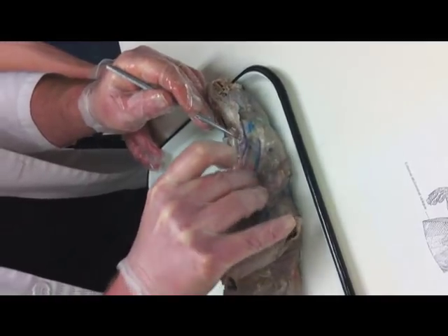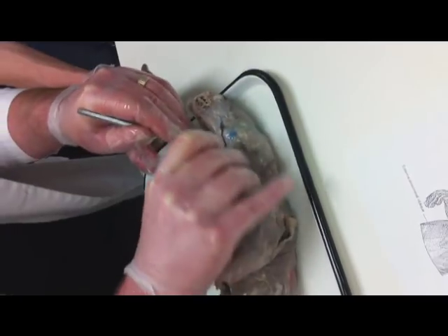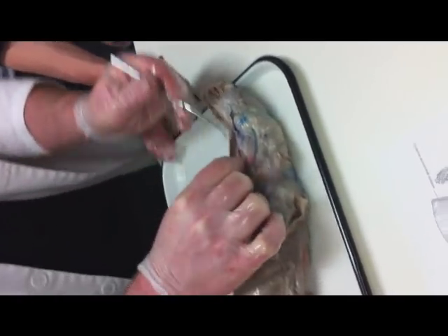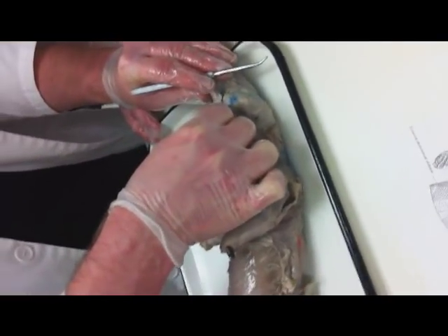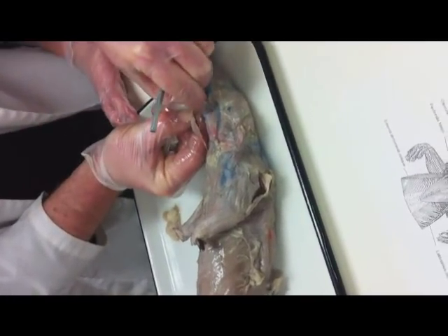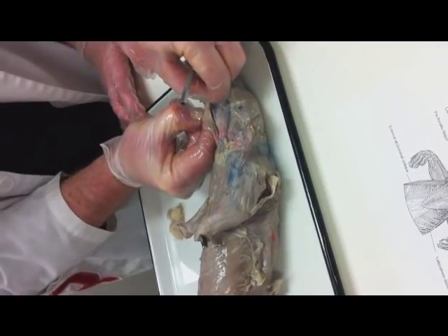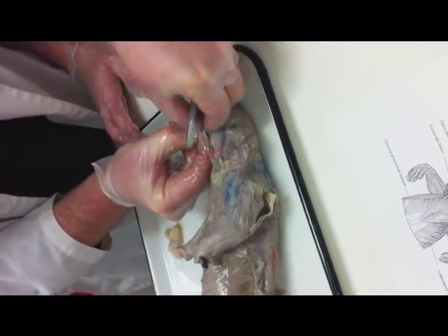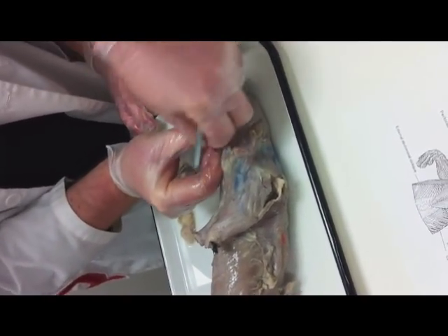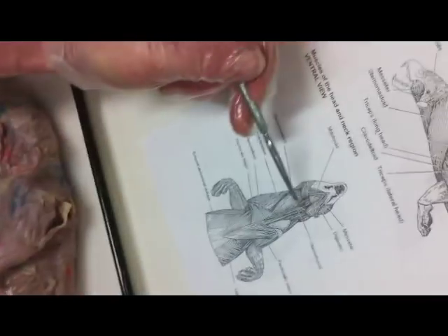Now, underneath the sternomastoid are two ribbon-like muscles, right there. Two ribbon-like muscles. There's one. See that? And what's kind of cool about these muscles is they're actually attached together. Watch, I can tease them apart here. You can see that there's a clear line between them. See the line forming? There. I'm teasing them apart. And those are the sternohyoids.